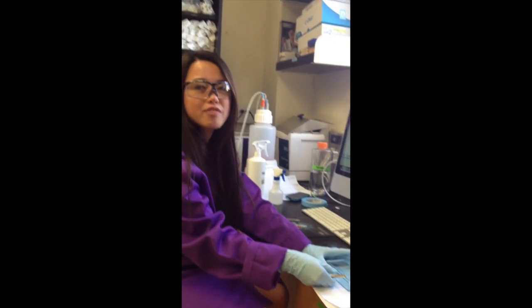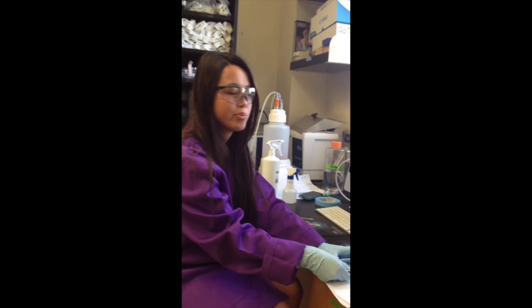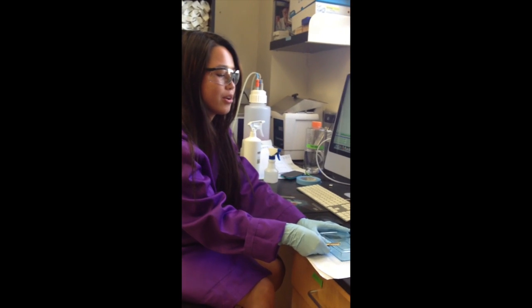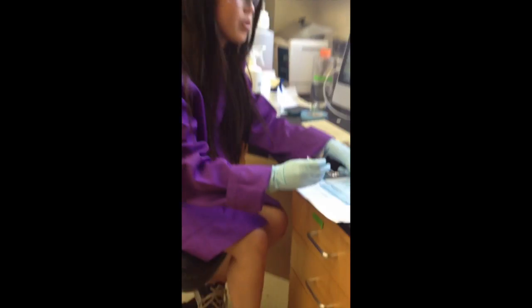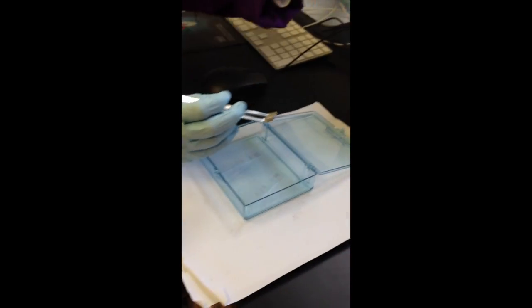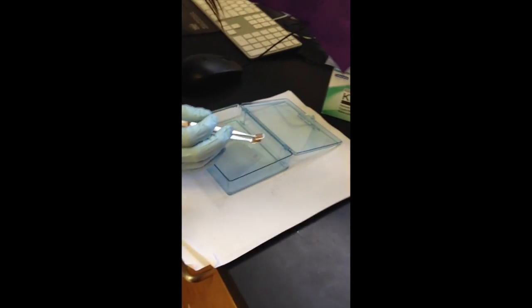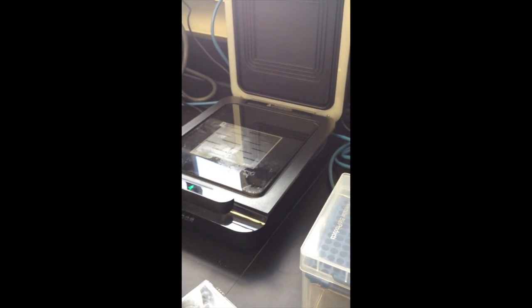Okay, after the five minute incubation period, we will use forceps to pick up the Western blot and open the C-digit scanner.